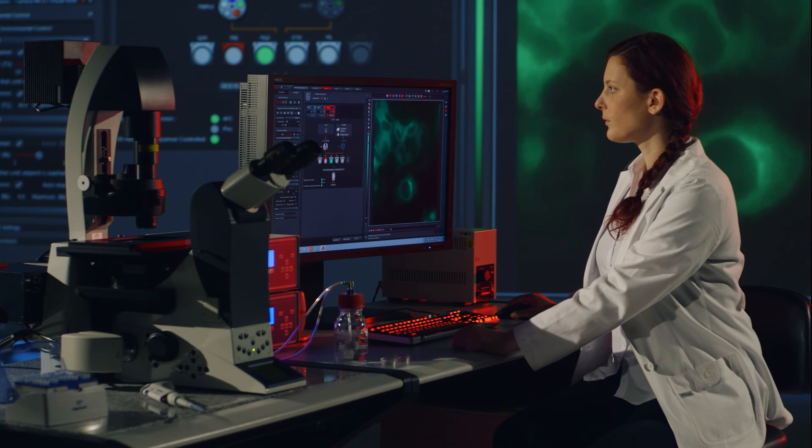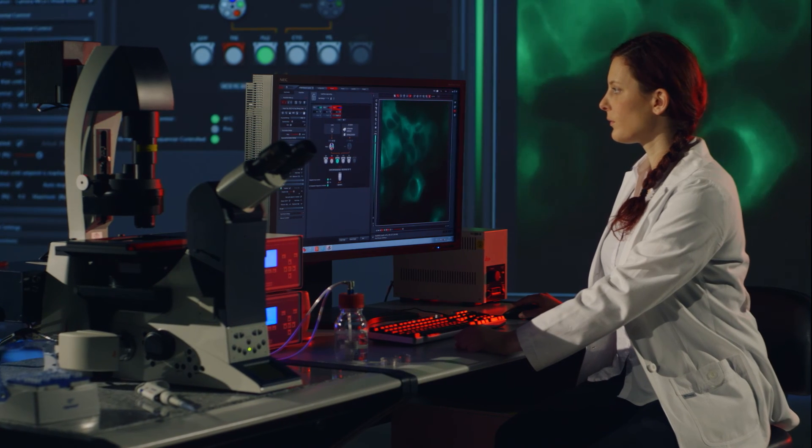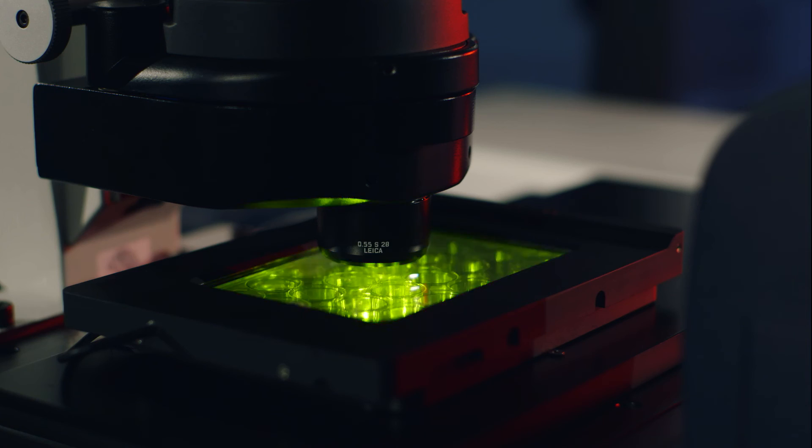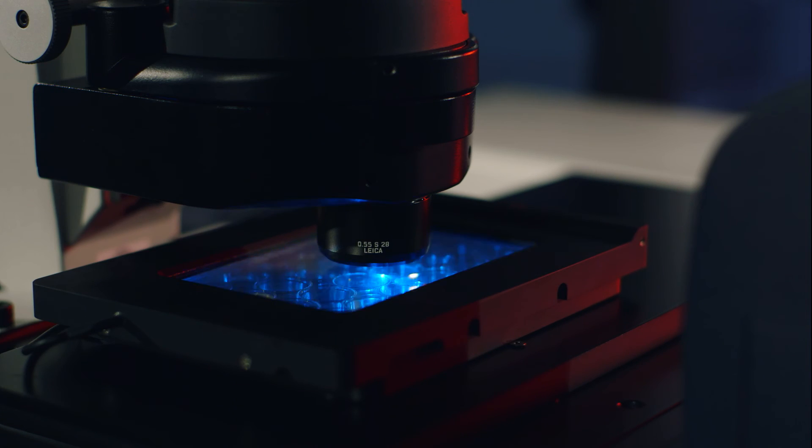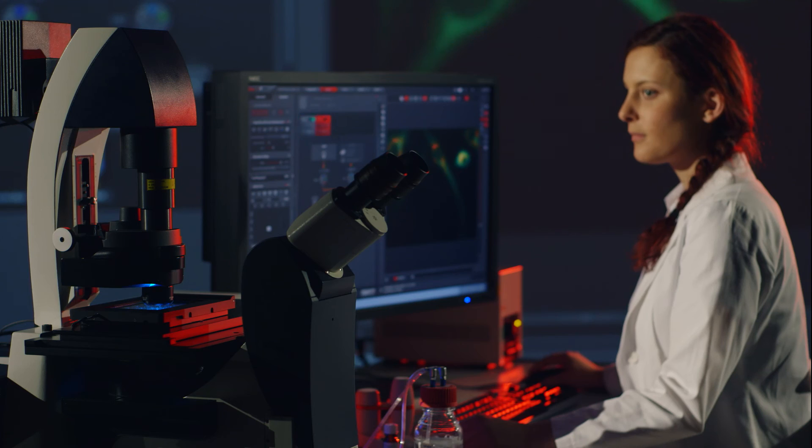Leica Application Suite X takes usability of the pioneering software solution to the next level.